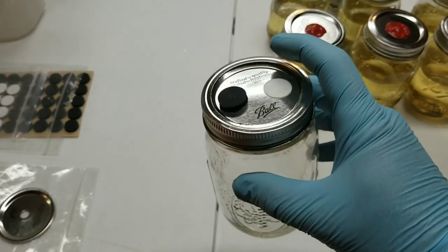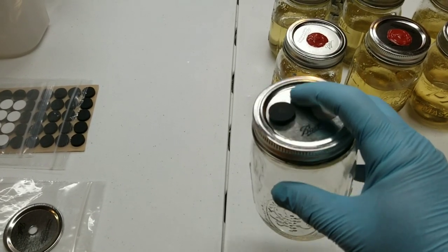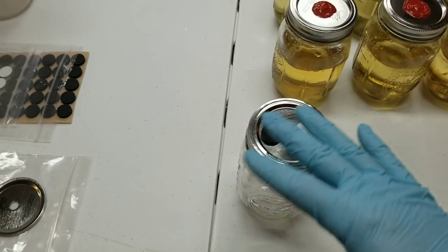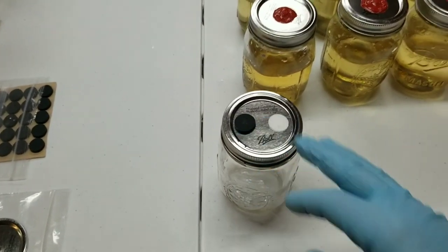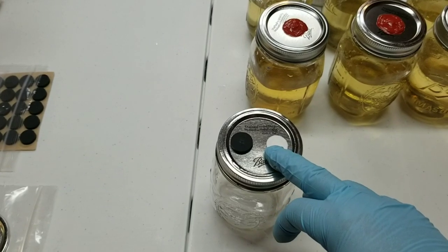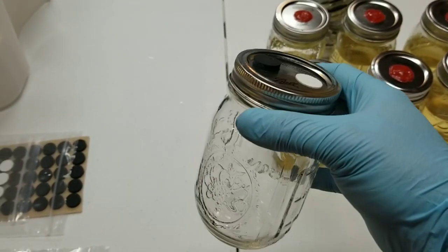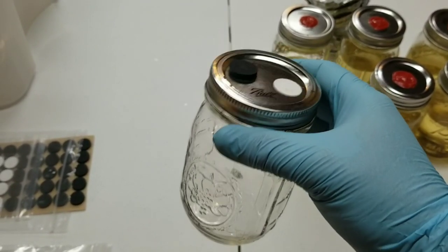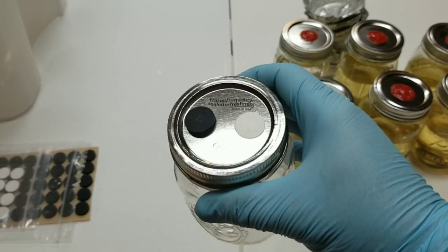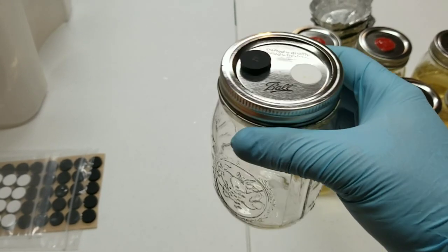Obviously the filter disc allows the pressure to equalize automatically on your jar so you don't have to do it yourself. As the jar cools it draws sterile air right through the filter disc. That's important because with liquid culture jars you can't have them in a state of vacuum. The drawbacks to the vented lid are that you're going to get super chunky mycelium because you'll get lots of fresh air exchange — your mycelium goes crazy in the nutrient broth. And if you're not using really large gauge syringes you can get clogs.